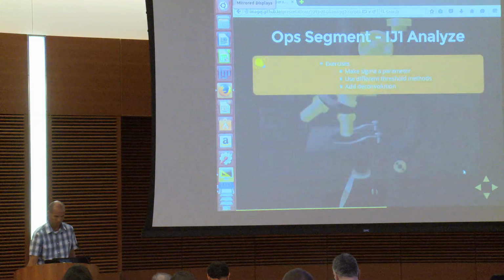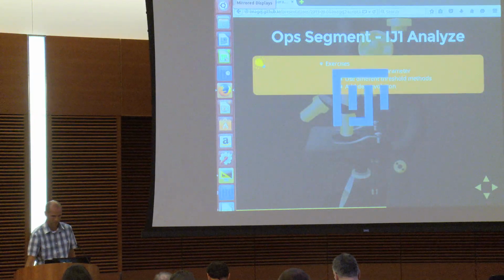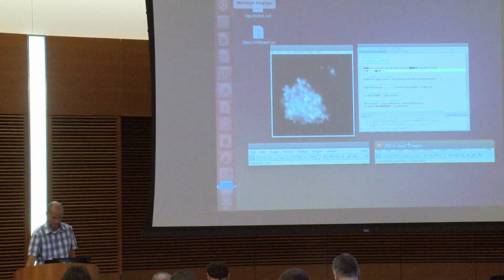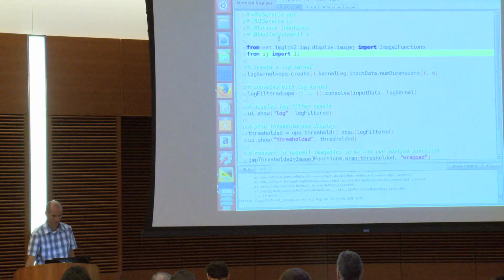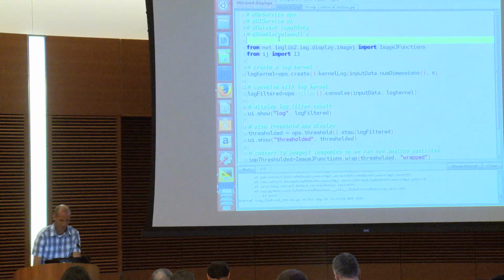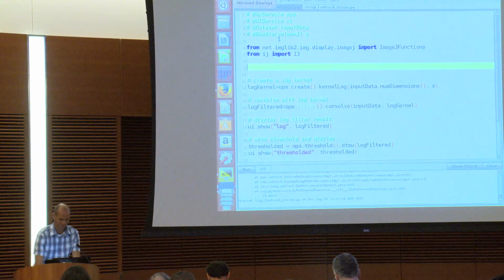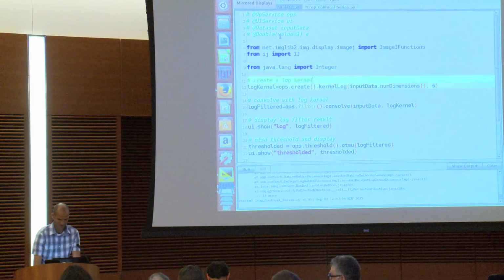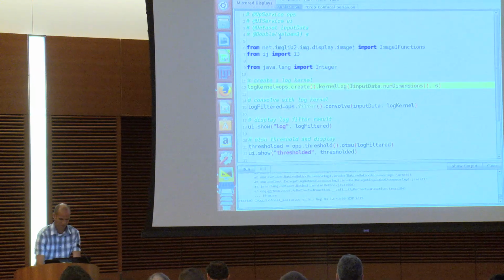I just opened up another one. But anyway, what I wanted to do here was for Java. Okay. From. It's this. Oh, that's right.